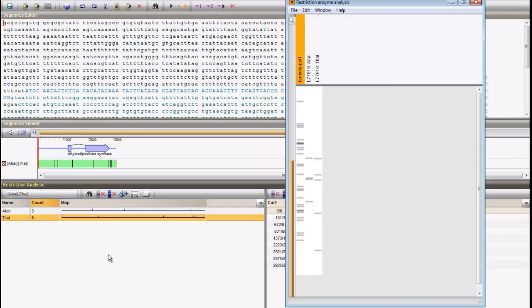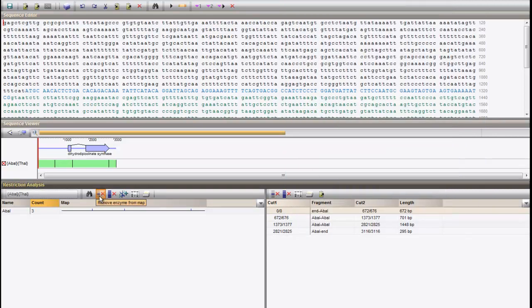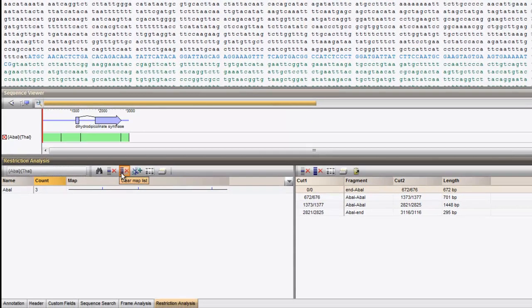You can remove an enzyme from the list with this button. You can remove all enzymes from the map with the next button.